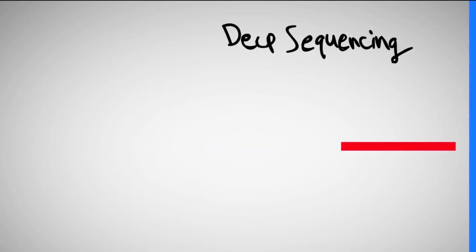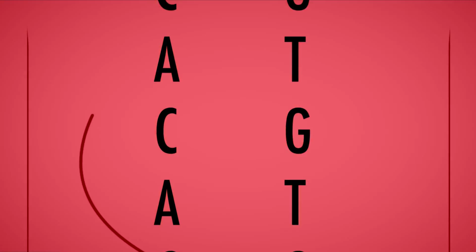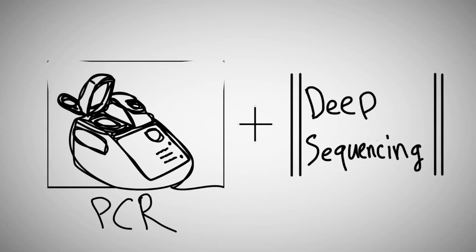If we do, we can test that sample through next-generation sequencing. We can't do that with all samples because it's much more expensive technology, so we need to be able to prioritize them. Another benefit of next-generation sequencing is that it allows us to look for viruses that are really quite different and new. Therefore, we complement our main PCR testing strategy with deep sequencing to be sure we don't miss viruses in samples, and that way we can get a better picture of what viruses are out there.